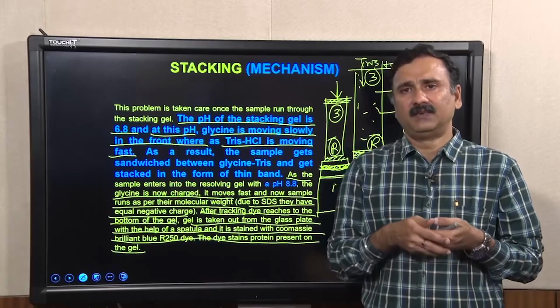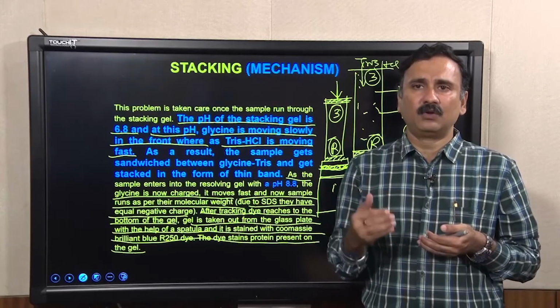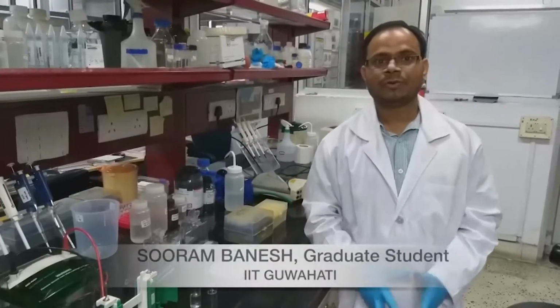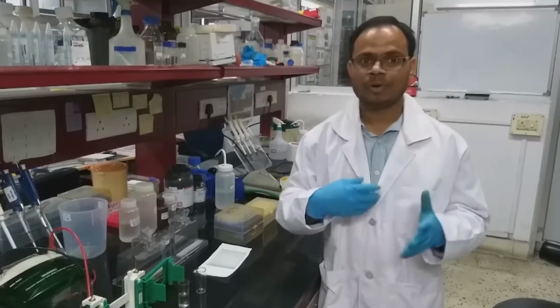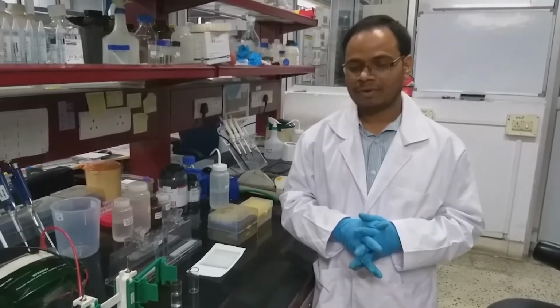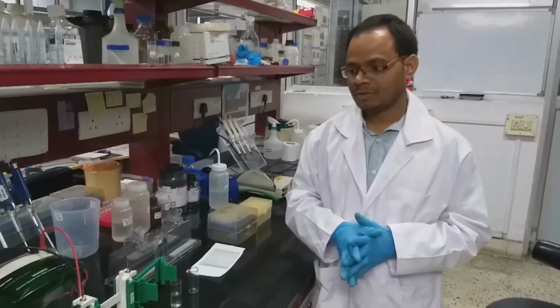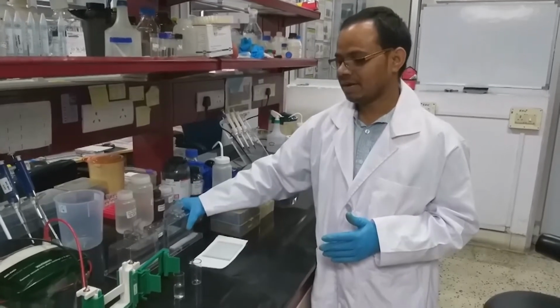In this demo, the students have resolved the samples, and they have also shown you how to stain and destain. In this video, we will demonstrate how to run an SDS based gel, how to prepare the various reagents required for running an SDS based gel, and what the different instruments are that we can use. So here, this is the gel casting stand.